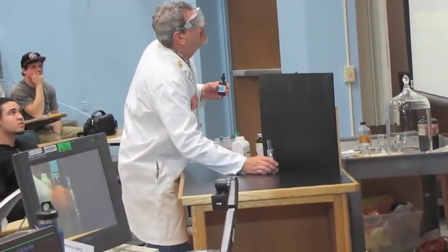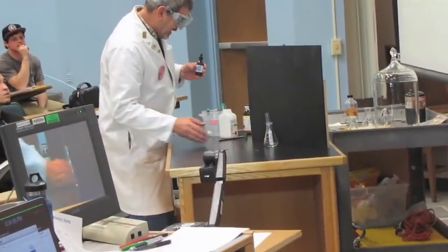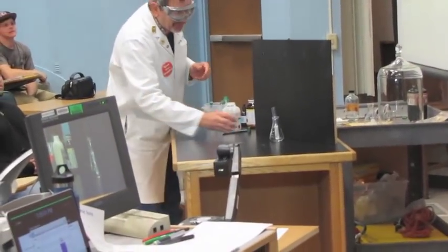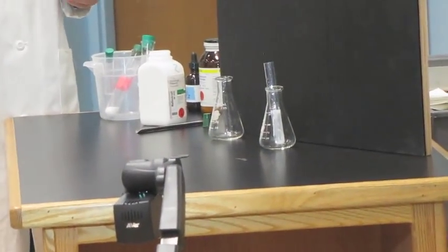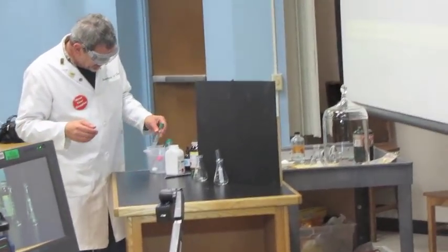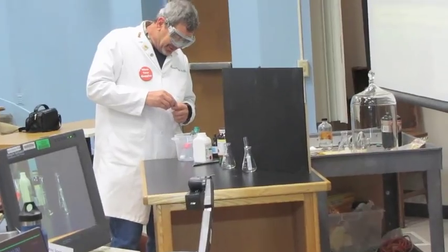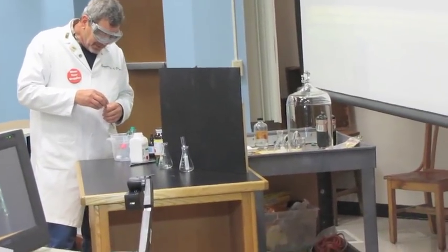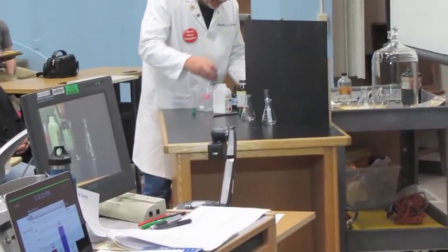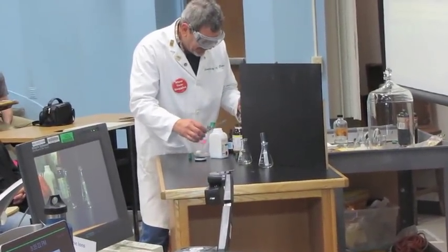So that's potassium chloride. Let's try the same thing with potassium chlorate. So we see two of the properties there. One, a physical property of potassium chloride is soluble in water. The other chemical property is that it reacts with silver nitrate to make an insoluble precipitate. We'll learn more about that later.